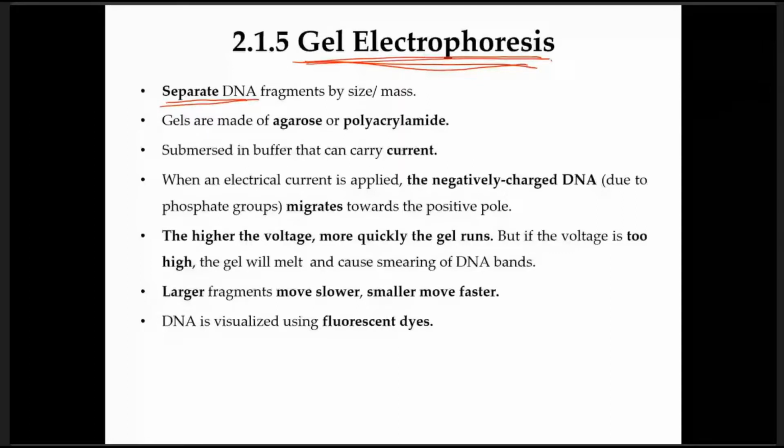So the procedure or the method requires you to prepare a gel. You have to prepare a gel that is made up of agarose or polyacrylamide.